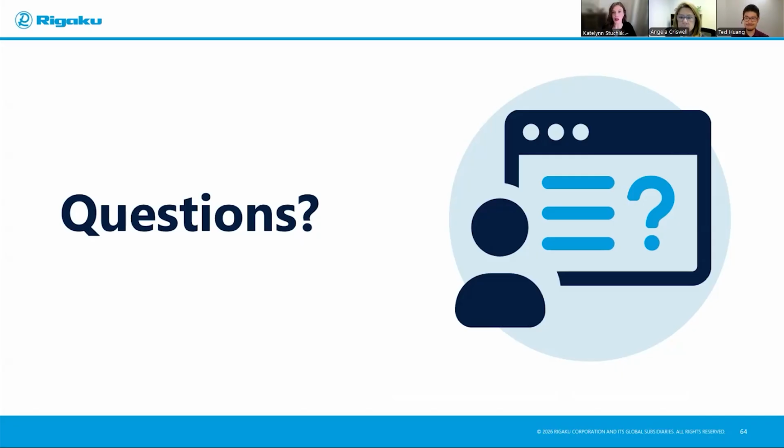Thank you. Our next question is, what are the benefits of CT if the feature that I'm interested in still requires me to cut the samples? Yeah, that's a very good question. I can see that's the one you ask when you learn that there are some cases that still have to do sample preparation, then why should I use it? How does it differ from other destructive techniques?